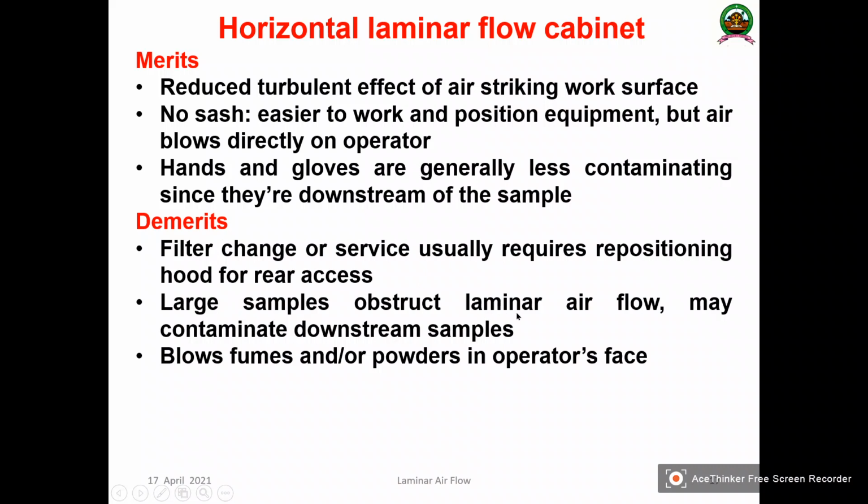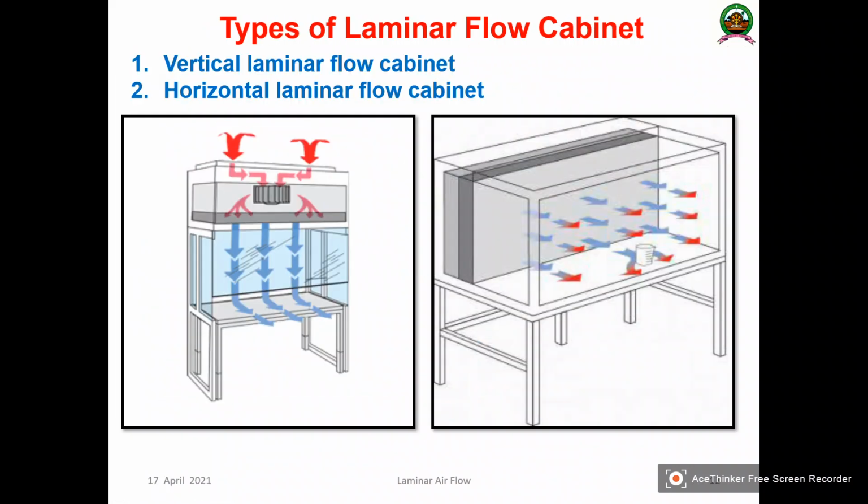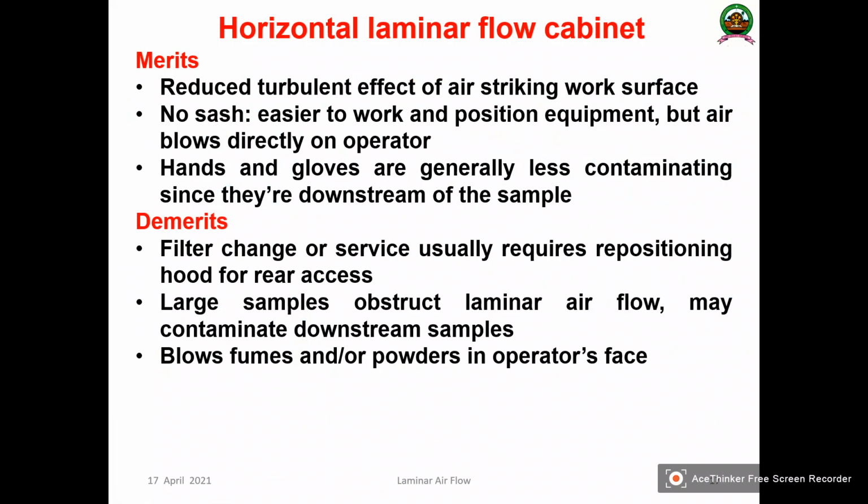Larger samples obstruct the laminar airflow and may contaminate the downstream sample also. Blows of fumes or powders in the operator's face are a constant problem, because the operators are sitting here and the flow is towards the face of the operators. So it creates some blows of fumes and powders to the operator's face.